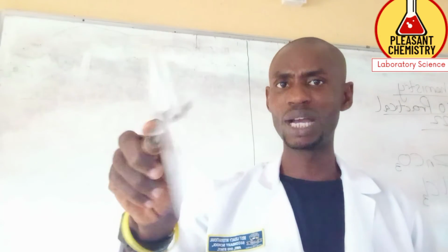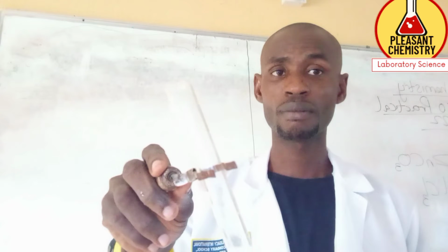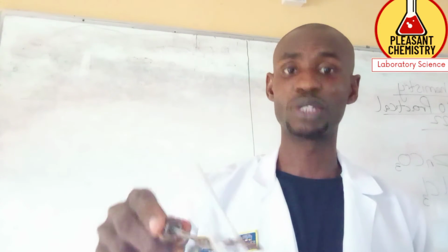When we say white gelatinous precipitate, it means that it looks like starch. That's why you must know the theory of the practical, because I already know that it is aluminium that is there, and zinc and aluminium have that property. Zinc and aluminium both give a gelatinous precipitate.